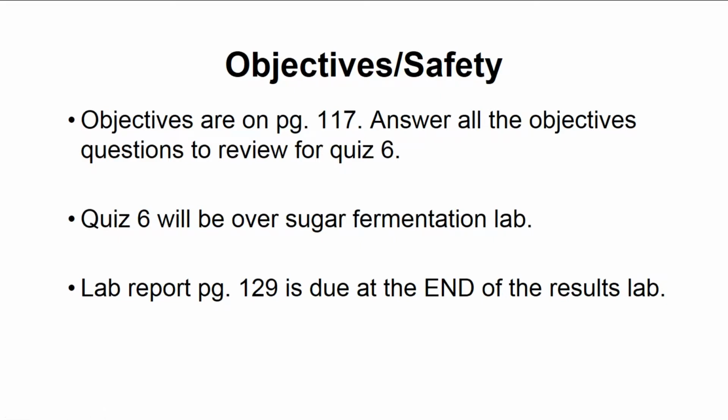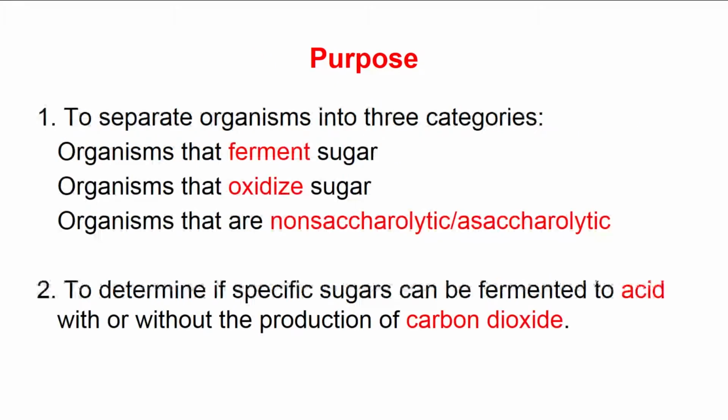Things like making sure you have proper protective equipment, goggles, gloves, and lab coat, long pants, closed-toe shoes. Make sure you don't drop anything. Try to avoid that. Notify your instructor of any breaks or spills. Okay, so the purpose of the carbohydrate test.